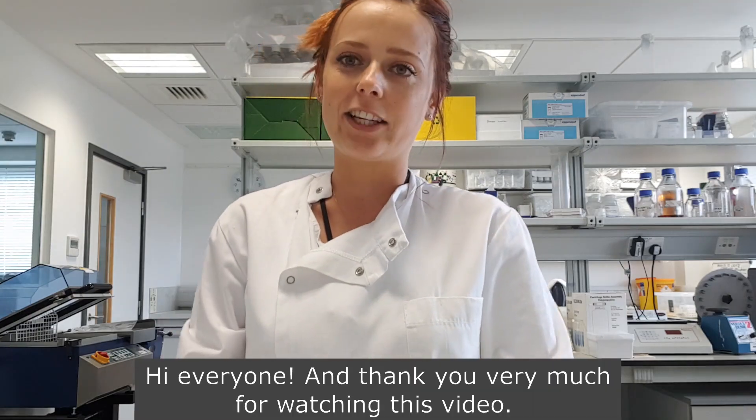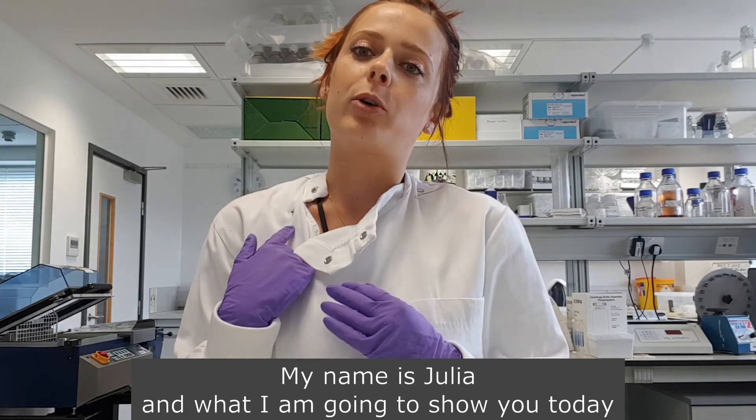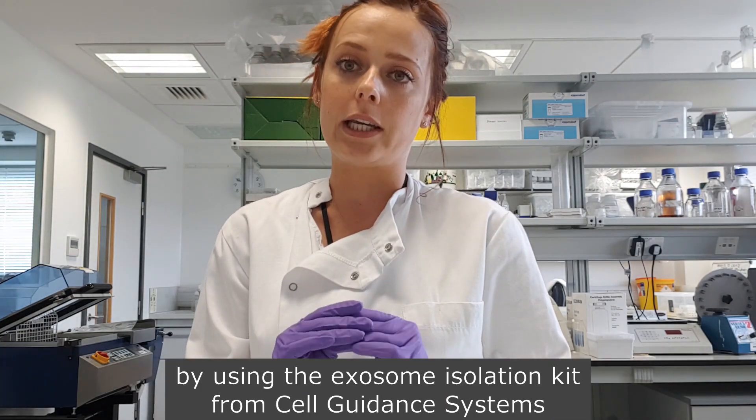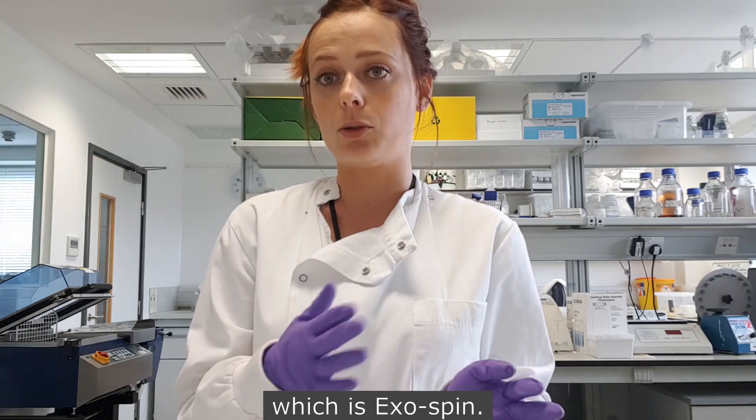Hi everyone, thank you very much for watching this video. My name is Julia and what I'm going to show you today is how to isolate exosomes by using the Exosome Isolation Kit from Cell Guidance Systems, which is Exospin.